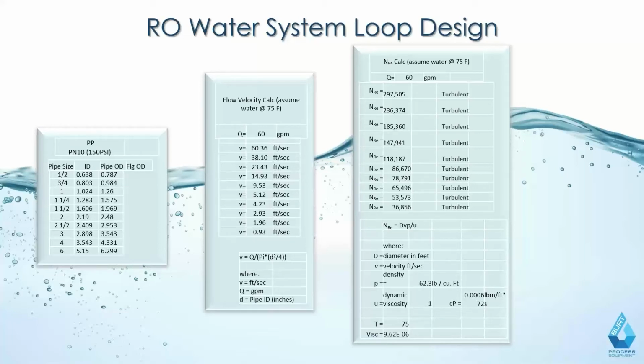Hello, everyone. This is Madison here. Mark, I had a question for you following up on these past couple slides. So you just mentioned using pressure, as it's sometimes a misnomer, to knock off bacteria. So I'm imagining with all of the turns in the loop, there has to be some kind of sanitization to keep bacteria down within the loop. So what's required in loop sanitization, and how often is that process required?